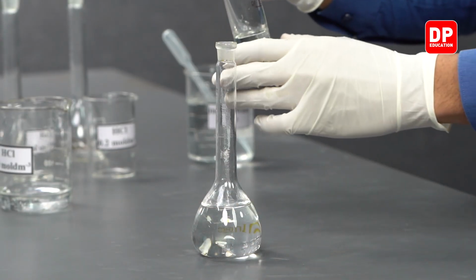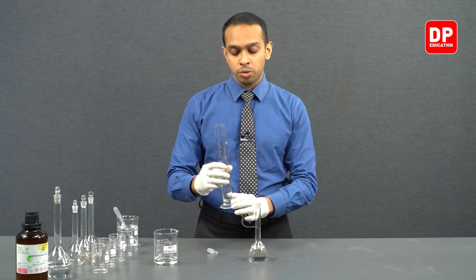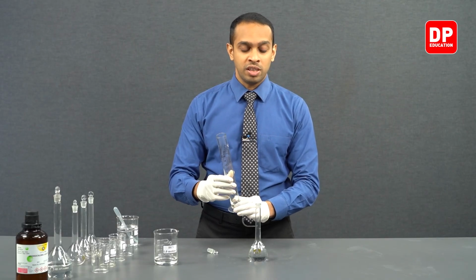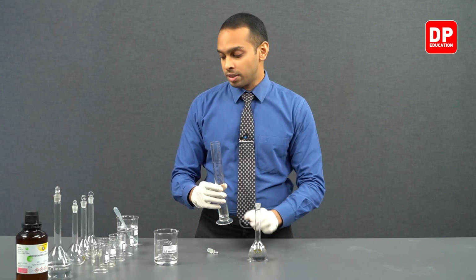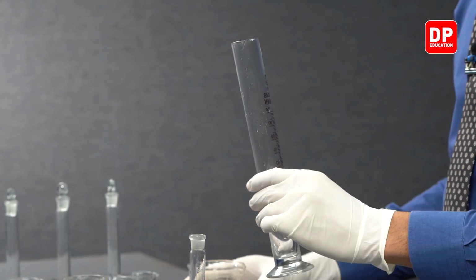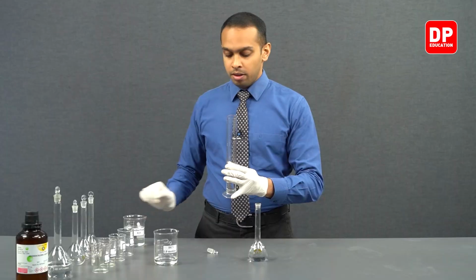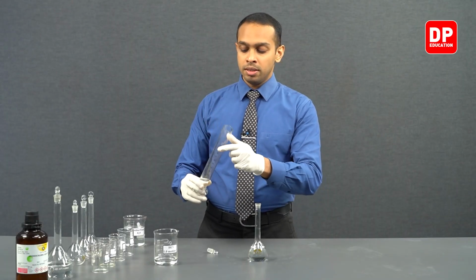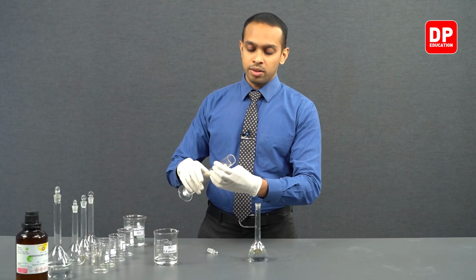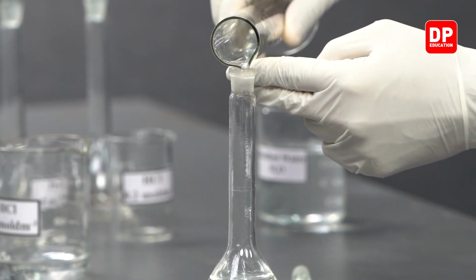Keep in mind students, when you're transferring this volume into the volumetric flask, you should not be spilling any of the HCl. So you have to be very careful when you're transferring this volume to our volumetric flask. After that, we can take a little bit of distilled water and add it to our measuring cylinder, and we can wash the interior walls of the measuring cylinder with this distilled water and transfer it into our volumetric flask as well.